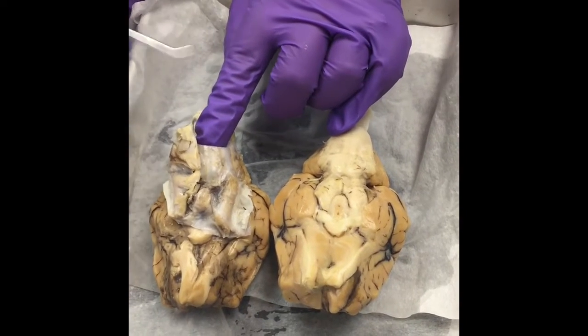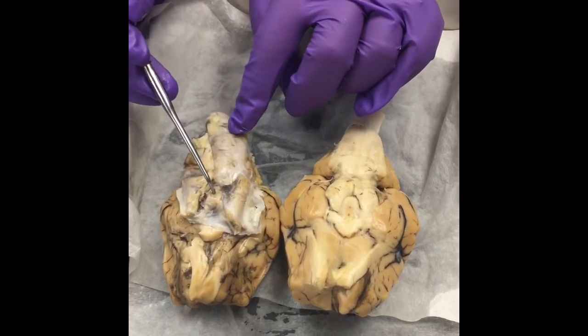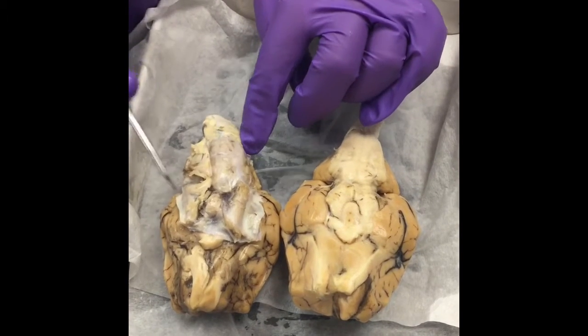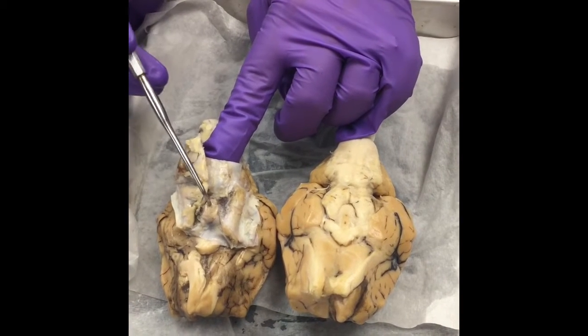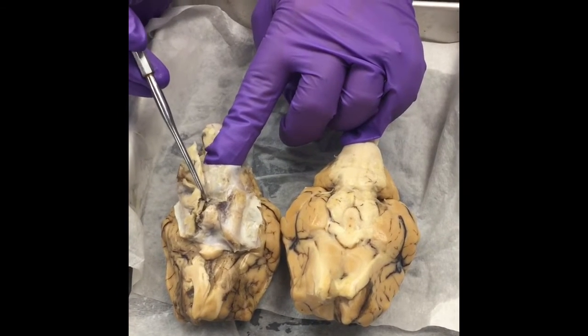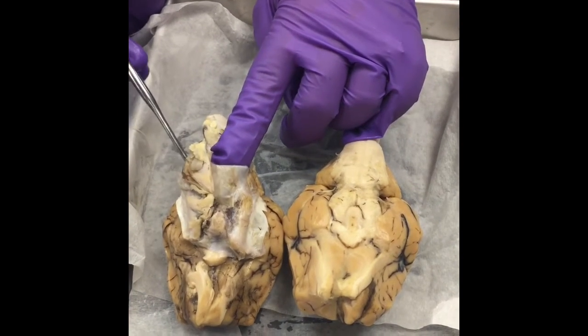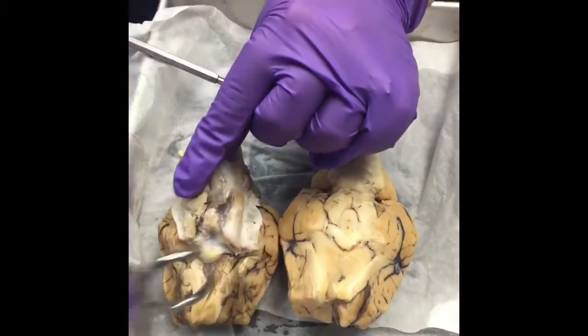But what I want to show you before I remove the dura mater is this right in the center. Doesn't look like much. It looks like it's just another lump in this flap of tissue. But this is actually the pituitary gland, which is a huge gland that controls your endocrine system, all of the hormones in your body. So I'm going to remove this piece.